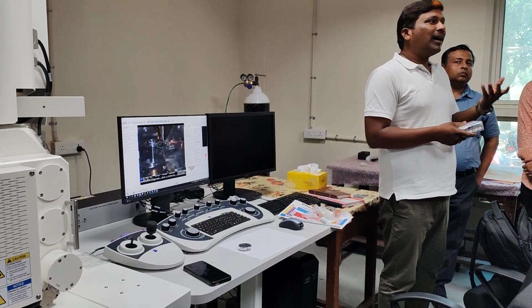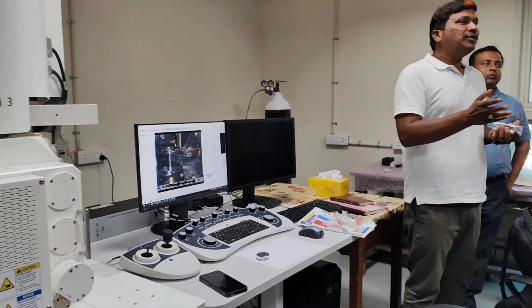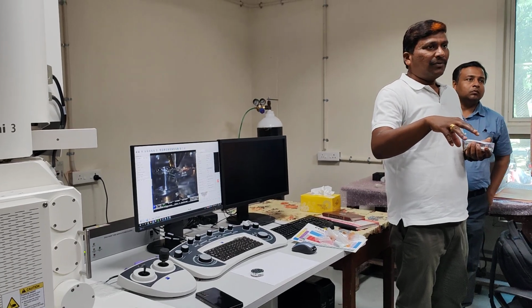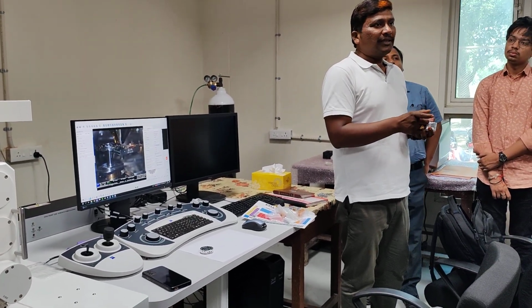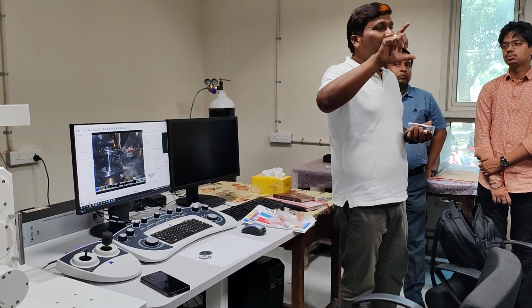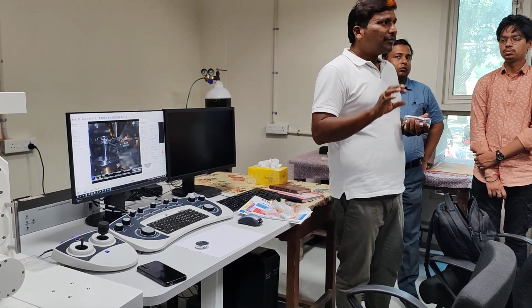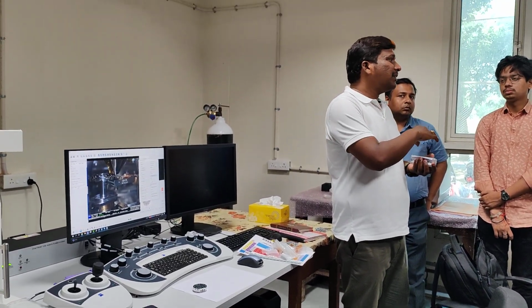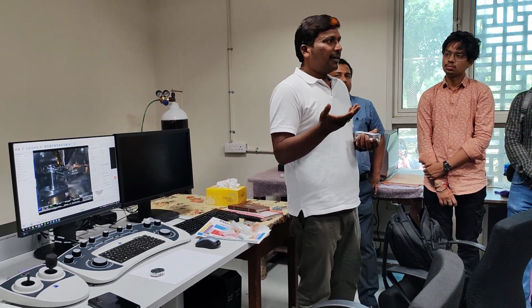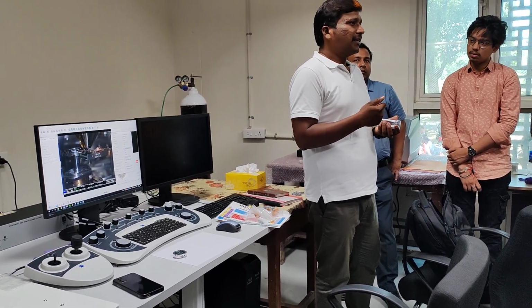If you are looking for a high resolution image, or for true topography information, you know the difference between topography and true topography, right? If you are looking for material contrast information, the thickness of a thin film, or the arrangement of fibers, there you need a little bit higher depth of focus. So try to give as much information as possible so that you can reach your expectation. If possible, give some already published data related to your sample and then submit it, then definitely he will understand.